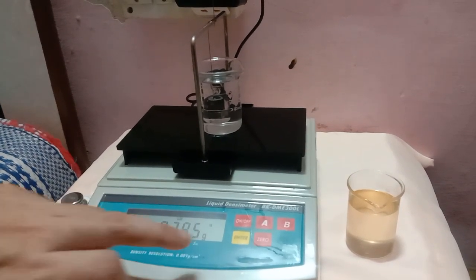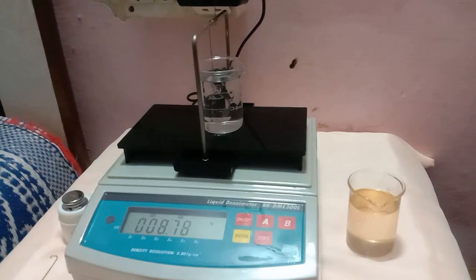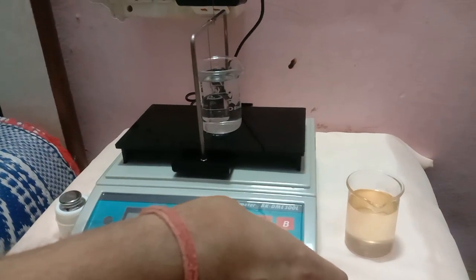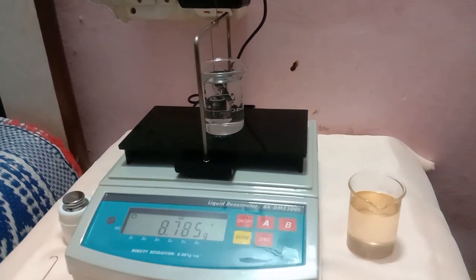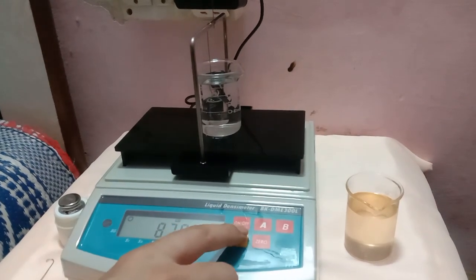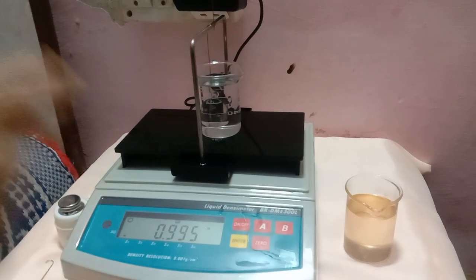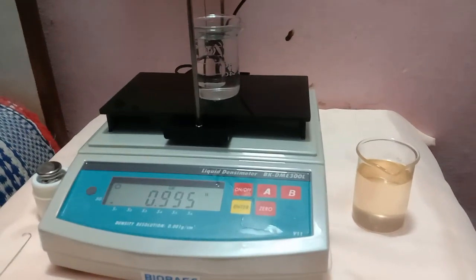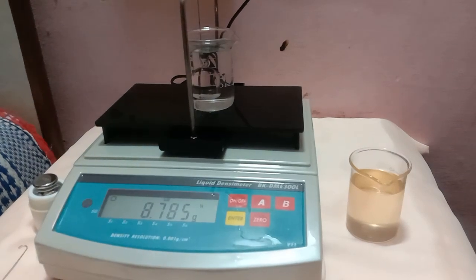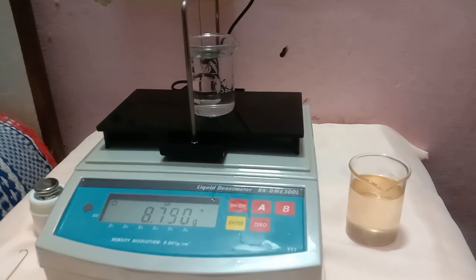Once it's stable, just press Enter and B to register the value, and again press Enter to save the value. Press Enter again to go back to normal. This is basically the whole calibration process.